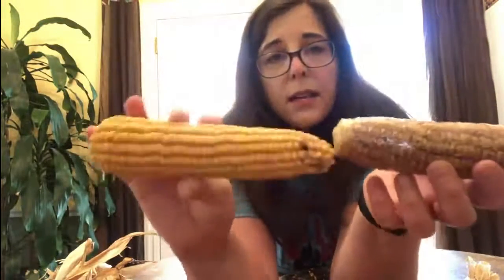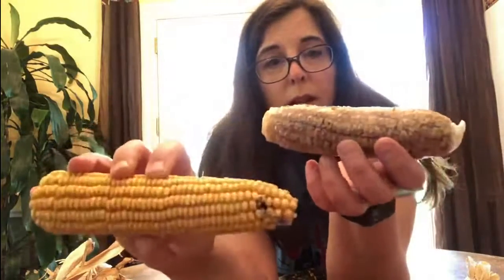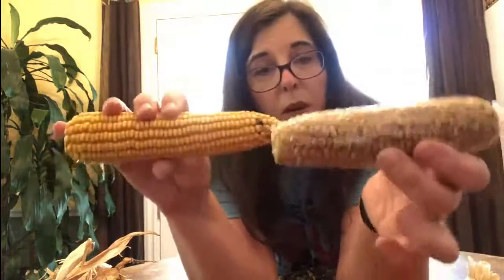Now the other thing here that we see, so this is a yellow starchy type of corn, that's what seed corn is, and this is a yellow wrinkly type of corn, which is the sweet corn that we eat. But in addition to these two phenotypes, we also have the yellow versus red.